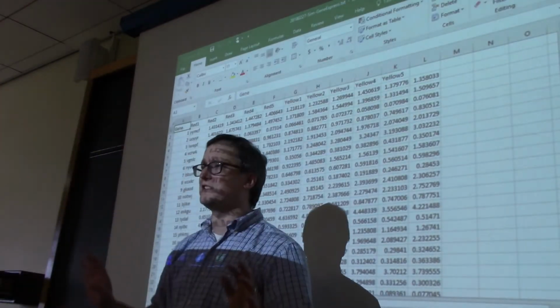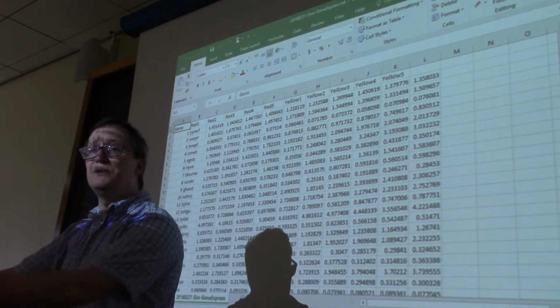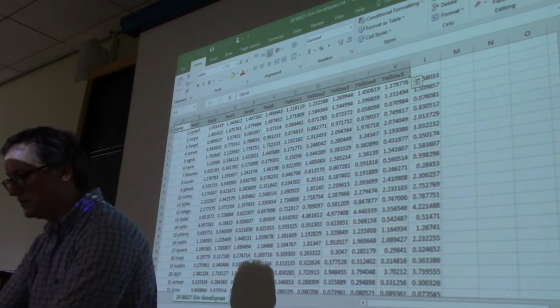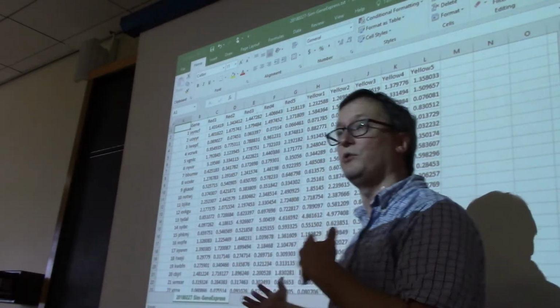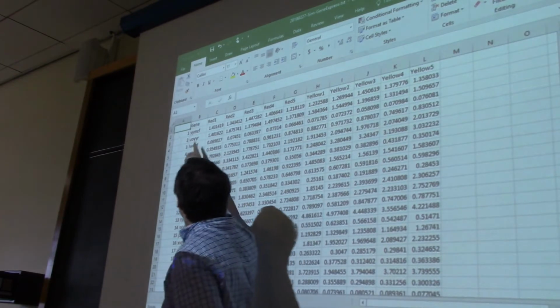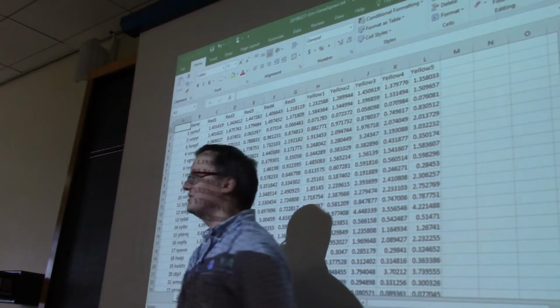There's another kind of oddity when you've written a table within R. You frequently find, having opened it in Excel, that your column headers at the top are offset by one position. So I'm going to cut them from here and paste them here. All of that was just to give us a chance to look at this table in a tabular format. So we see that the first column is just an index. What item number is this in the series?